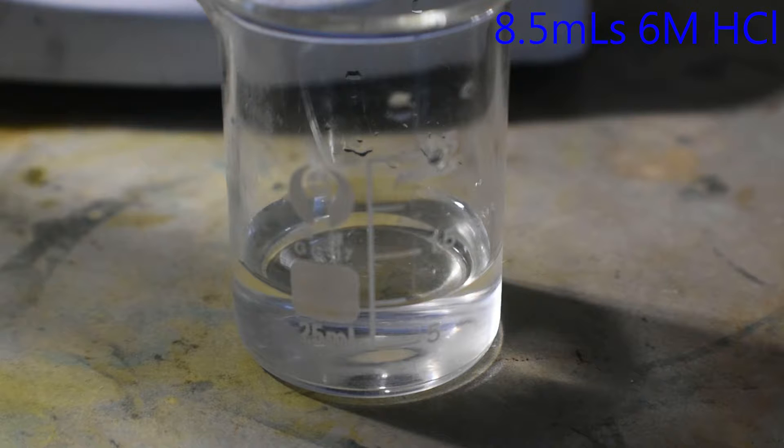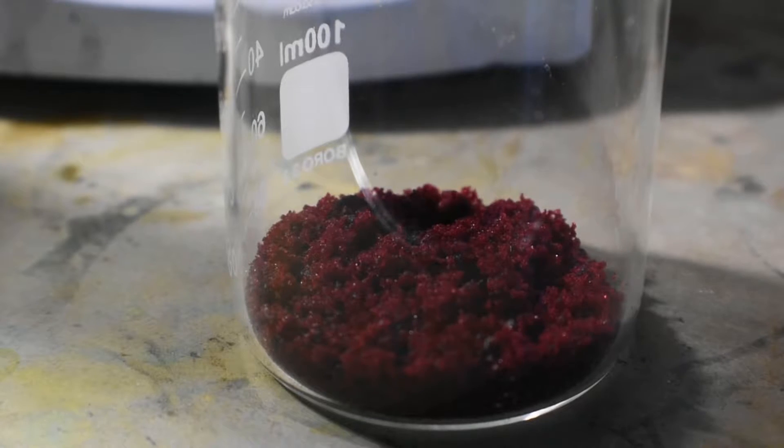Next, we're going to need 8.5 milliliters of 6 molar hydrochloric acid. Next, we're going to need 12 grams of cobalt(II) chloride hexahydrate. This will be dissolved in 35 milliliters of room temperature distilled water.